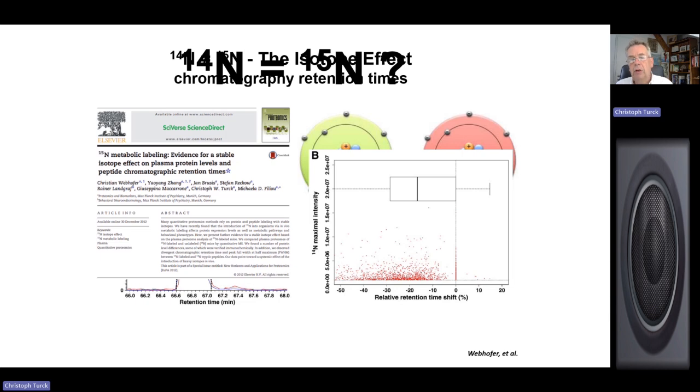But if you look closer with a fine-tooth comb, you can actually find differences. During chromatography, if you run very shallow gradients on the reversed phase column, we found that the 15N labeled tryptic peptides elute a little earlier than the unlabeled tryptic peptides. That was true for pretty much all peptides of the same sequence, so this was already an indication of an isotope effect. It doesn't matter for the relative quantification: if you make the window large enough, both peaks are fragmented. But it shows there is an isotope effect.